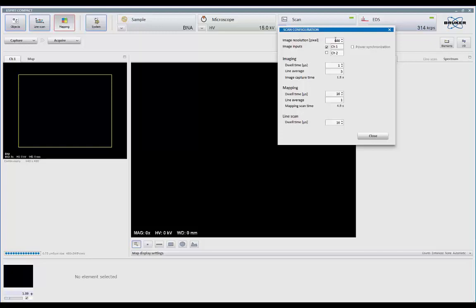So it's not the old 128, 256, 512. If you want 392, you can have 392. We match aspect ratios to the microscope. We also have dual video input if the microscope has the ability of outputting simultaneously two signals. Otherwise, everything that's in channel 1 is what will be picked up.